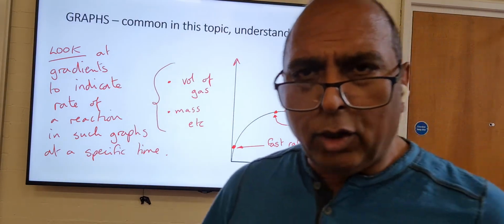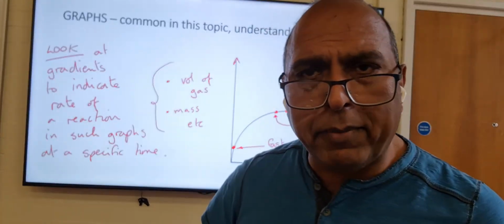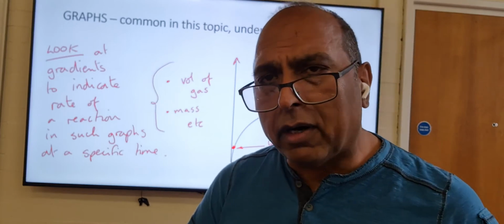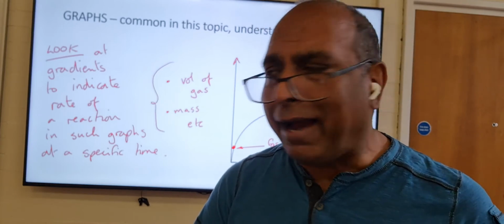Finally, let me look at these graphs in a bit more detail. Commonly, you are given graphs and you have to interpret them.